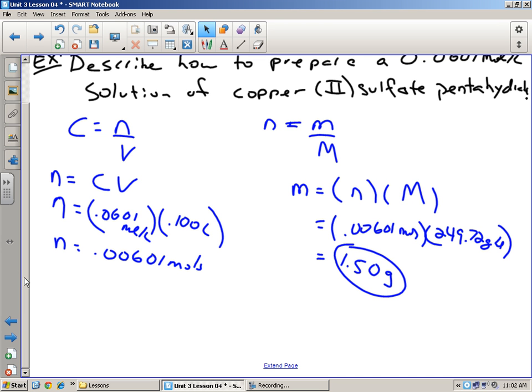The reason volumetric flasks are accurate is because you force the volume into a smaller opening. Look, you force it into a smaller neck. So it's more accurate. The skinnier this is, the more precise you can be, right? And I'll actually show you that tomorrow when we do the other standard solution measurement. You're going to see a really skinny, kind of a straw thing, a pipette it's called, and it forces it into a very skinny spot, and it's very accurate. Okay, so this is going to be pretty accurate here.